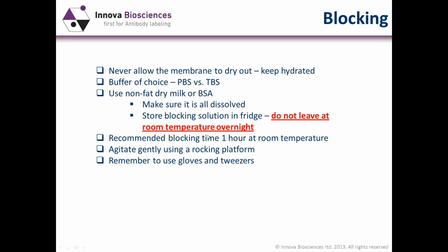I did try BSA several times, and based upon my experience of 3% BSA, unless I had a weak-binding monoclonal antibody, generally I would end up with high background with BSA, whereas non-fat dried milk seemed to effectively block all the non-specific binding opportunities on the membrane, and that resulted in a nice Western blot, or a nice film being produced from the Western blot itself.